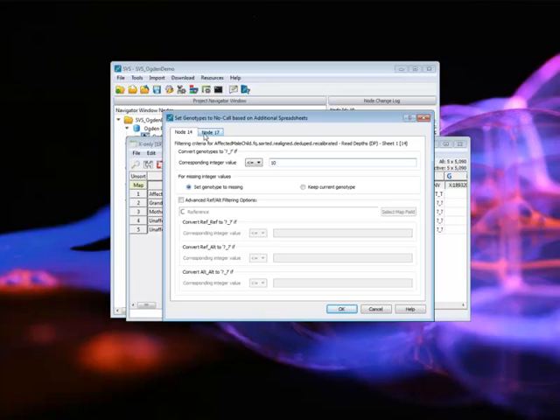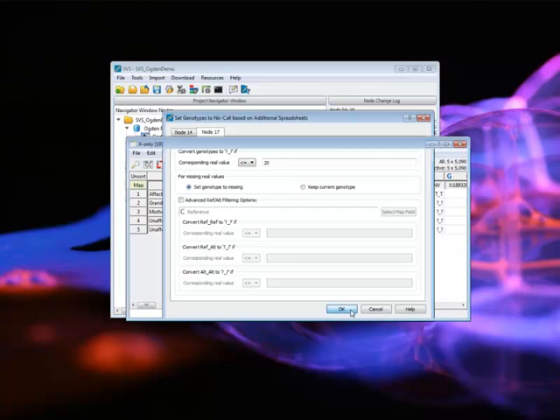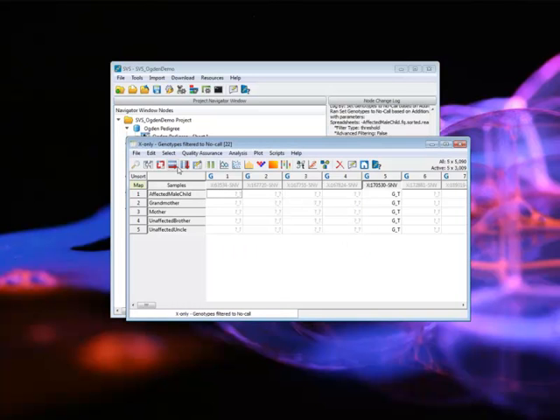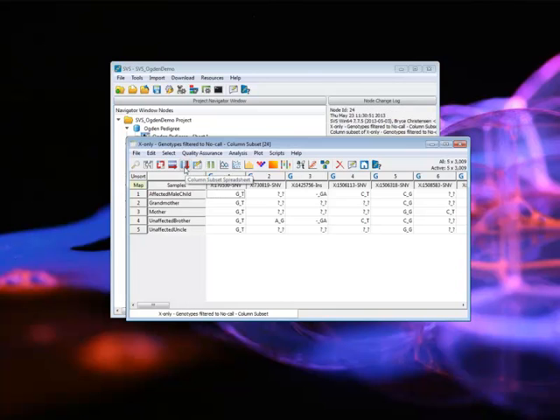So we put read depth at 10, which is maybe pretty low, but it works well for this data. Genotype quality score, I'll set a minimum threshold at 20. So on the Phred scale, that's like 99% confidence, roughly. And so it tells me a bunch of my genotypes failed those thresholds, so nearly 4,000, and 2,000 columns of data are now entirely uninformative. They've been removed. But what I have now is just 3,000 variant positions that I need to sort through.